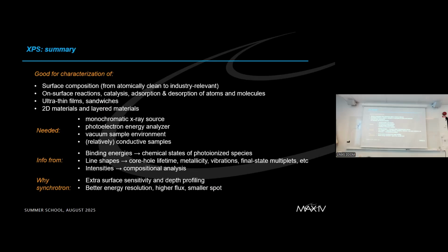Yes. Also, if you want to know the photon energy exactly, there is a nice way. At synchrotron, you can measure a core level on the kinetic energy scale in the first order light. Each monochromator is transmitting not only the first order light, but also the second order light because of some imperfections. And this is a parasitic light. Normally, we don't want to have it, the second order light.